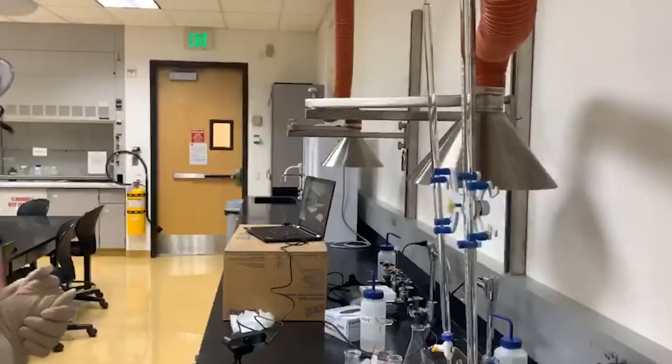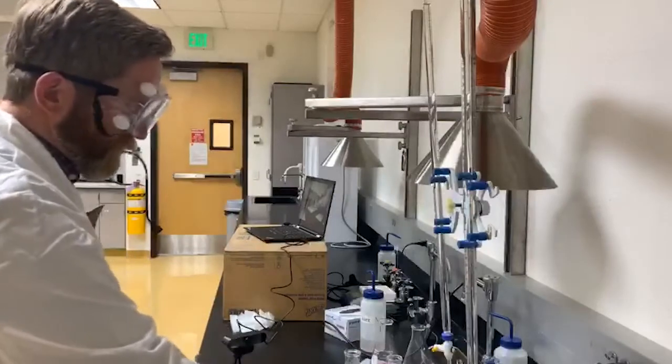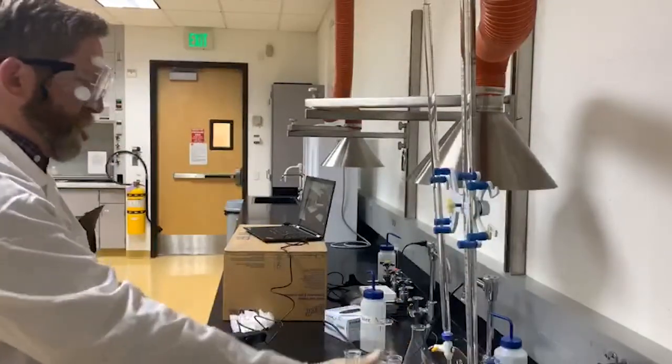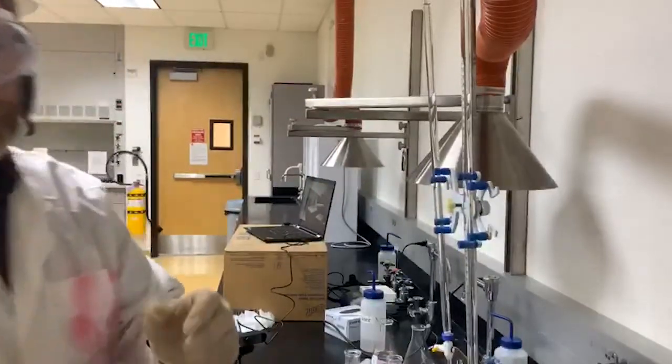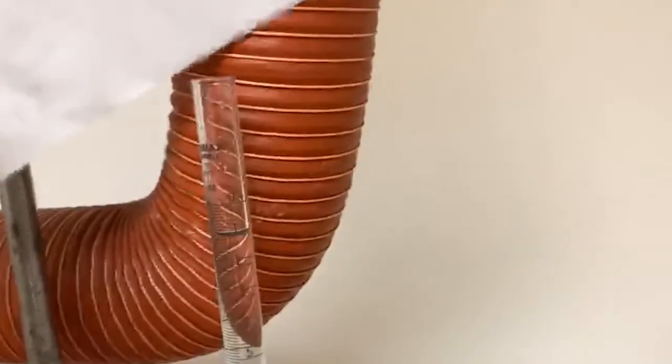All right, now we have our TUM samples here. So we have sample A and sample C. What I've done first of all is I've refilled our burettes so that we can take our measurements. So the first thing we've got to do is record our initial volumes like we did before, after you got all that nicely set up there. Okay, so this is Erlenmeyer flask A, or sample 1 with our TUMs. So reading the meniscus, take your initial volume. And this is our second sample of TUMs, Erlenmeyer marked C. And reading the meniscus, get your initial volume.